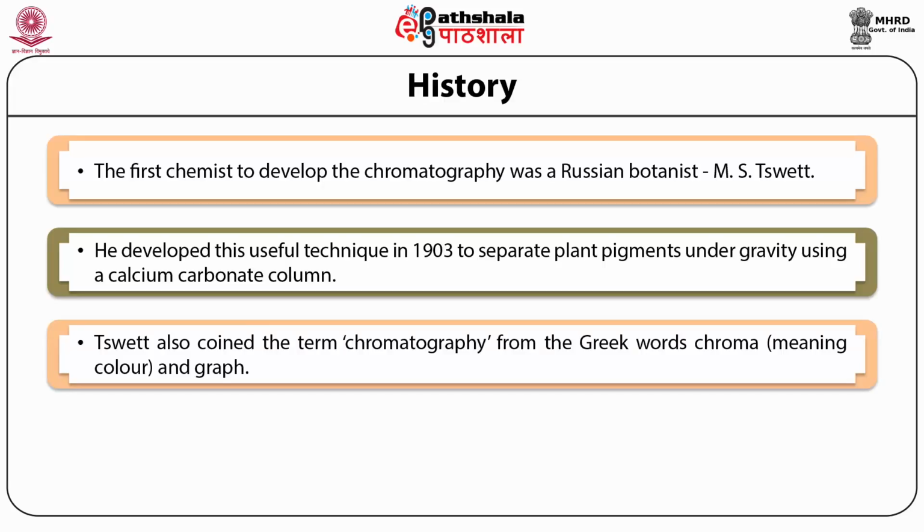Chromatography was recognized as a powerful technique that can separate a mixture into its components with great precision. In fact, it can be used to distinguish between two compounds very similar in molecular mass or charge. With the use of the right materials and operating conditions, chromatography is capable of purifying a wide range of soluble or volatile substances.